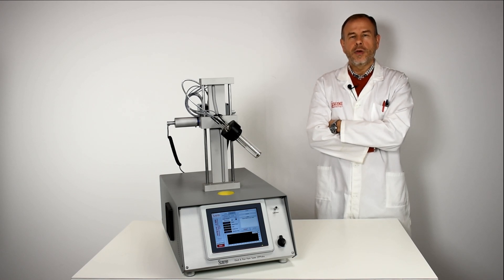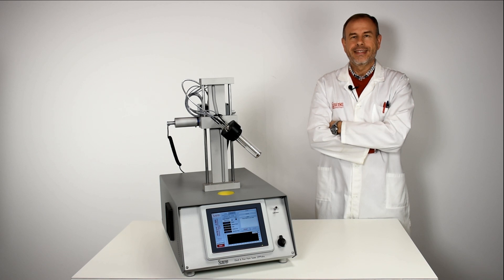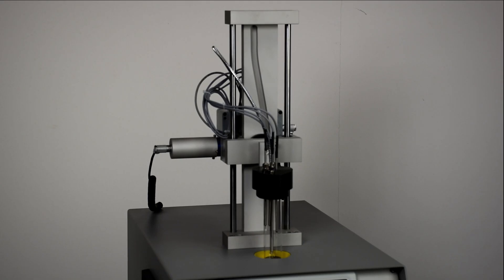But let's take a close look now to the equipment. The instrument can perform tests according to ASTM D97 and D2500 and their IP and ISO correspondents.